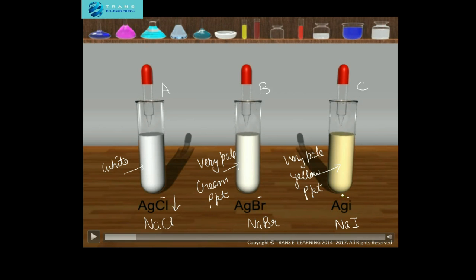Now how are these precipitates formed — what happens at the atomic level? We are going to zoom in to the respective test tubes to see how these precipitates form at the atomic level, then conduct the confirmation test at the atomic level, and then zoom back out to see what appears at the surface level.